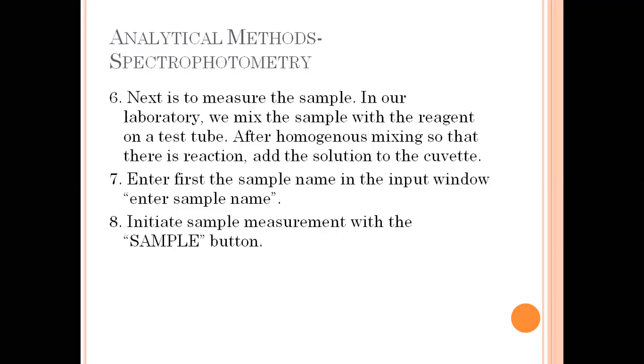So when you are already using or measuring a sample, you cannot press the blank button anymore but rather the sample button. Because if you press the blank, the solution to which you added the sample will now be the basis of all the readings, which is not correct because that could result in erroneous results, or that could affect the result of other samples. So, supposing you pressed the blank, that is not right.